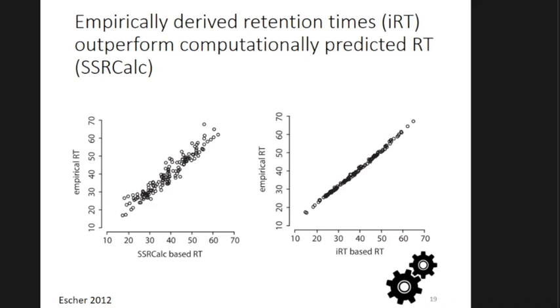If you're going to be changing between matrices, maybe tissue and plasma, those matrices are very different, and that will affect the IRT. If you change the gradient, that's another thing. You need to run another one to update your calculator with the IRTs, but you need to do only one run. You can just look for the IRTs if you want to set up the calculator initially.